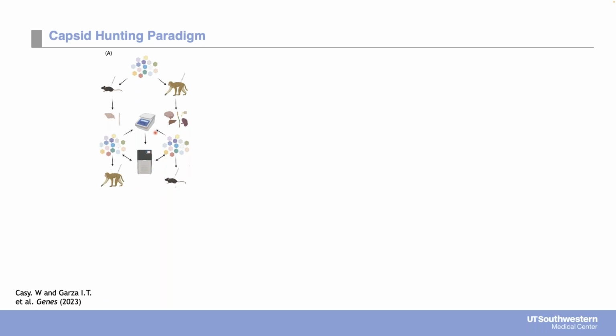And then in a second round of injections, we made tissue-derived libraries out of the cap genes that were amplified from the previous rounds of injection. This is where we implemented directed evolution to identify capsids that were enriched in the opposing species in the same fashion as we did in the first round.